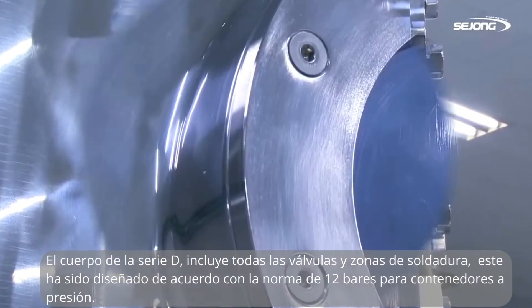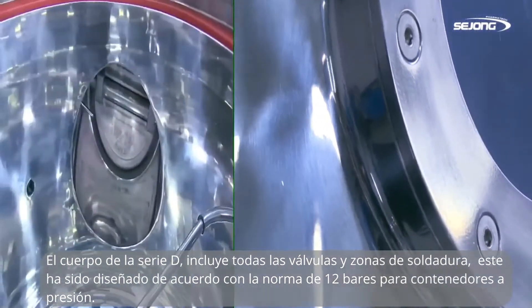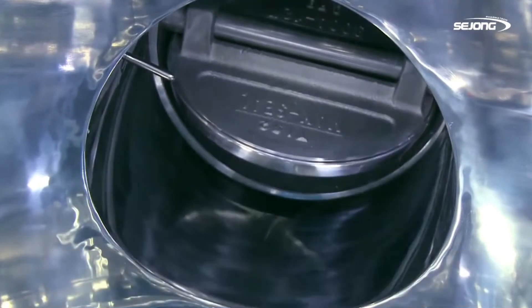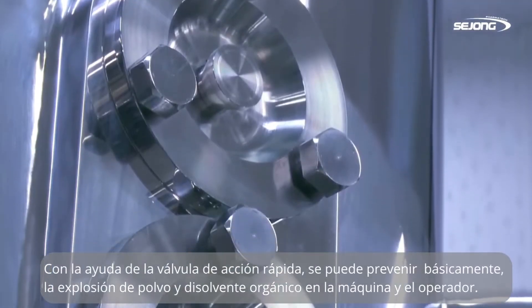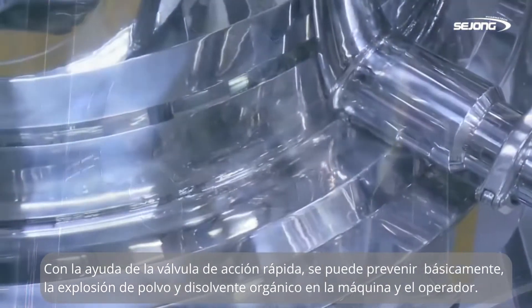The body of D-Series, including every flange, valve, and weld zone, has been designed on the basis of 12-bar standard pressure container. With a quick-acting valve, it can basically prevent the machine and operator from explosion of dust and organic solvent.